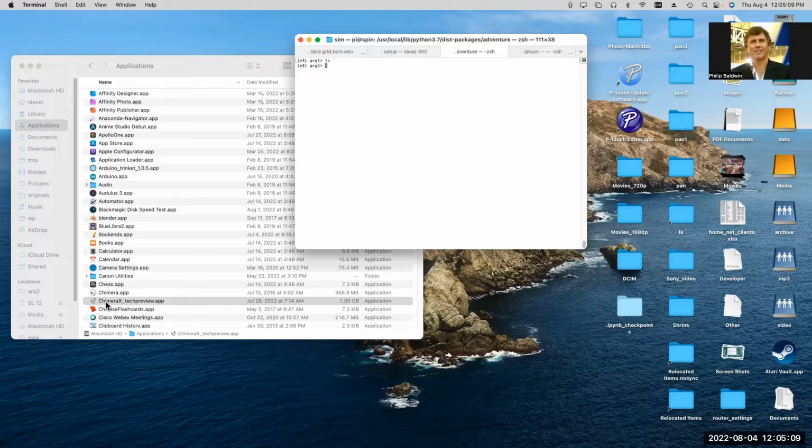Phenix, sorry, I was completely blanking on Phenix for a minute. The Phenix package, developed in Paul Adams' group at Lawrence Berkeley National Lab, is a nice package for doing X-ray crystallography sorts of things, and it has lots of tools for manipulating PDB files and mmCIF files. Then there are also lots of other Python toolkits out there which can manipulate those things.